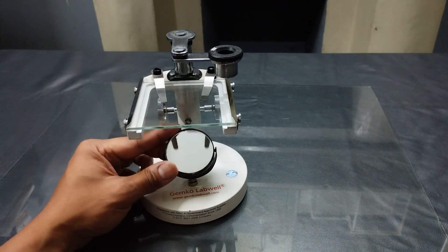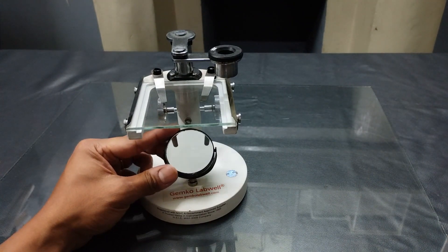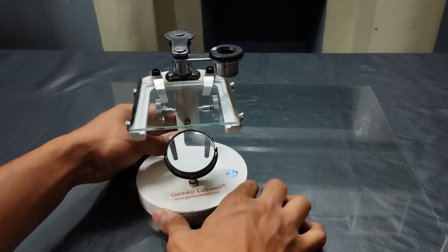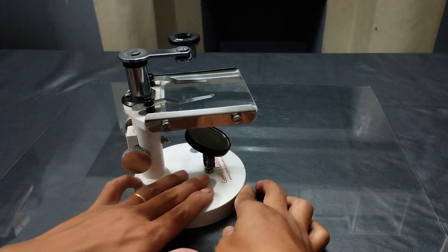The reflecting mirror located below the stage has both a plane and a concave mirror on either side. The entire structure is supported on a heavy and sturdy base or foot.